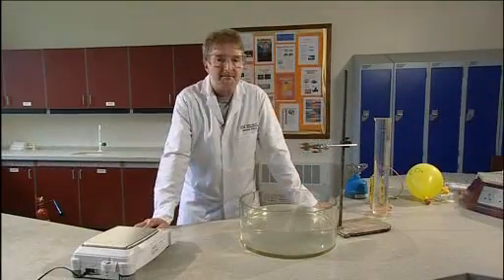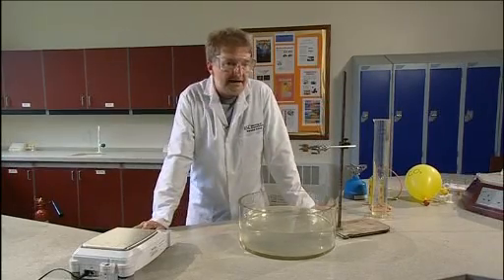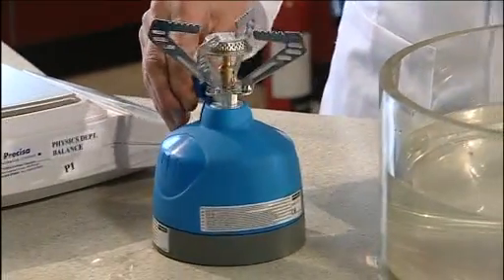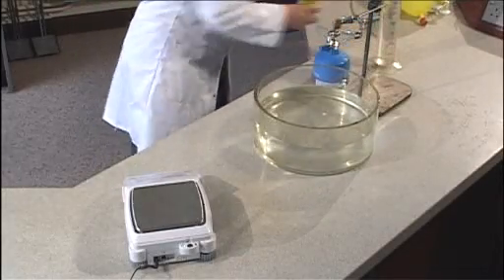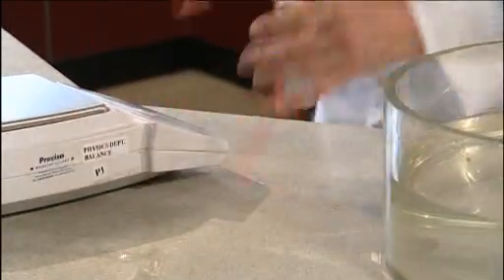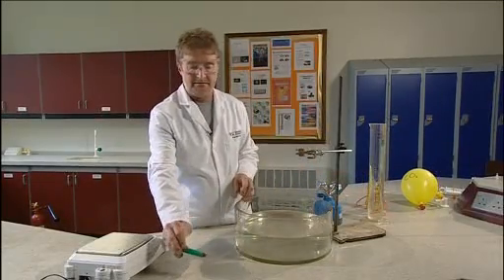This demonstration is about measuring the relative molecular mass of a gas. The gas needs to come from a source that can be weighed on a top pan balance. We're going to use gas from a camping gas cylinder, but other possible sources are gas used to fill gas lighters. We can improvise a bit of tubing on the end, or even from a disposable gas lighter itself.